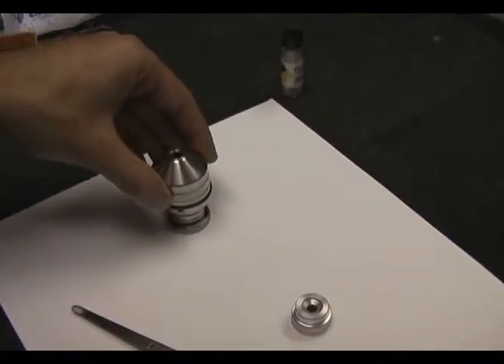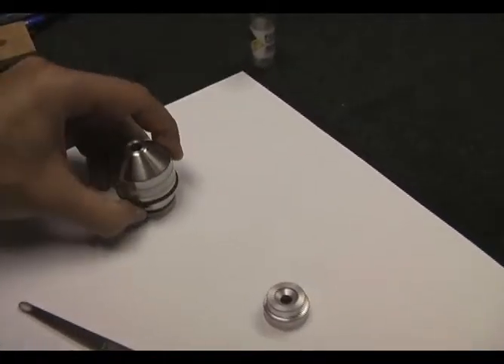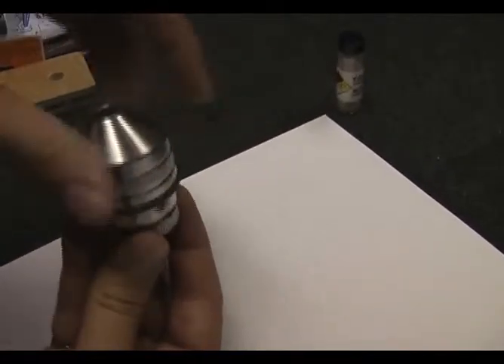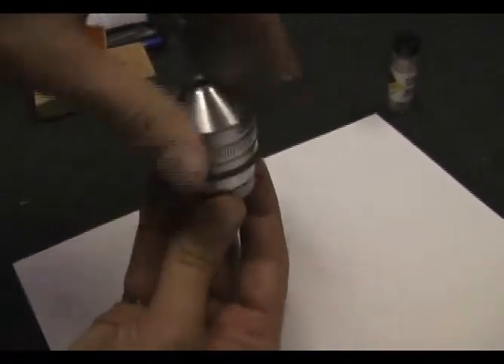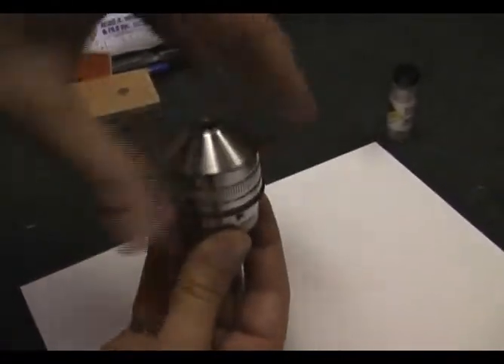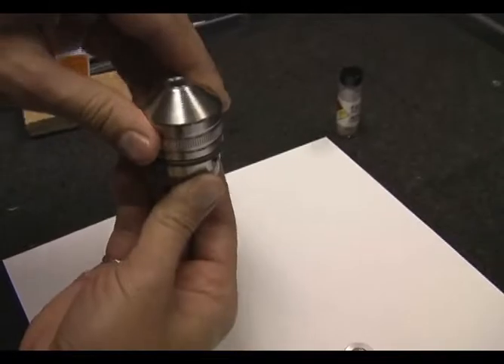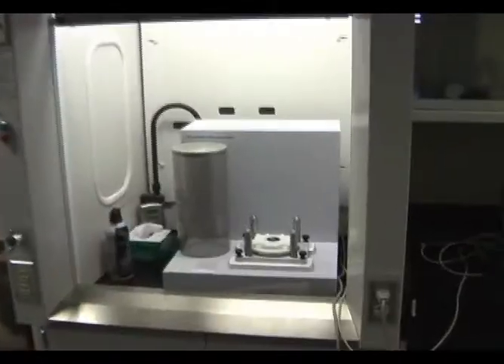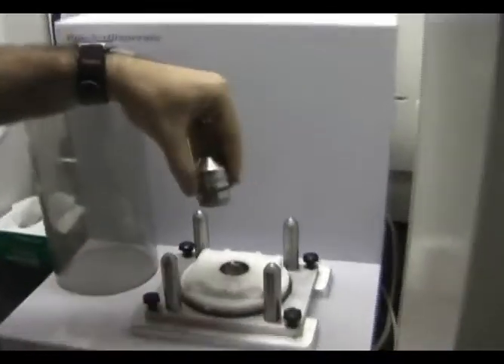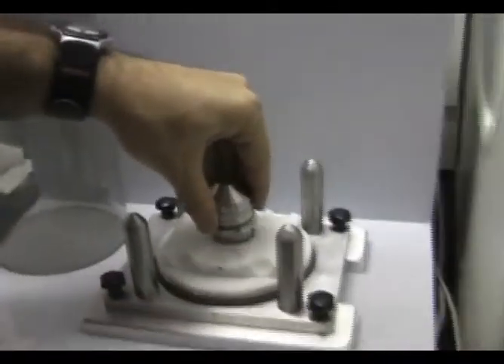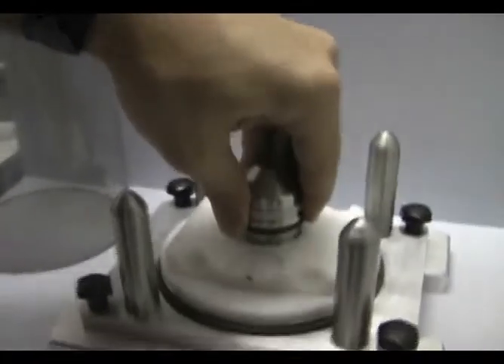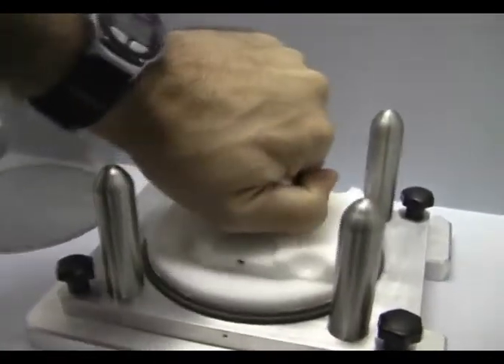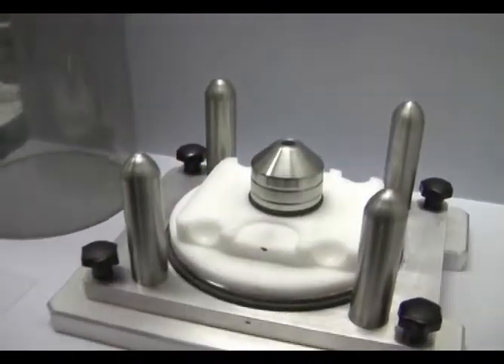Then you put the cover on top of the whole assembly and screw it together. The sample now gets placed on the main unit. This chamber sits right here and it's a bayonet fitting. You just have to rotate it to lock it in place.